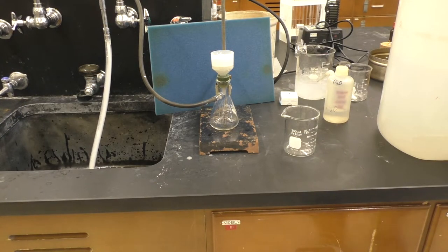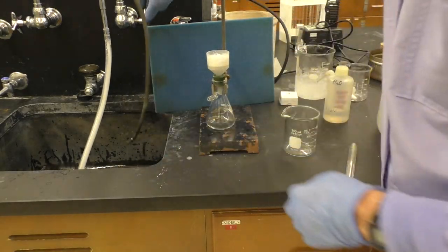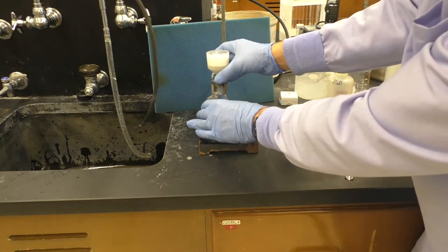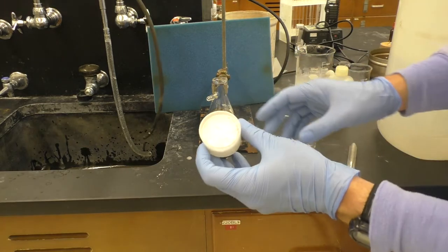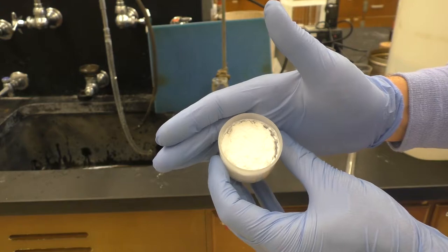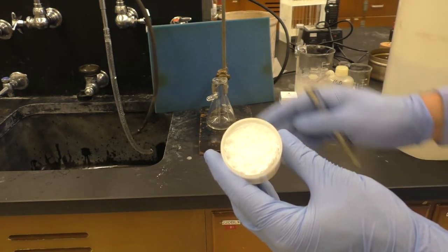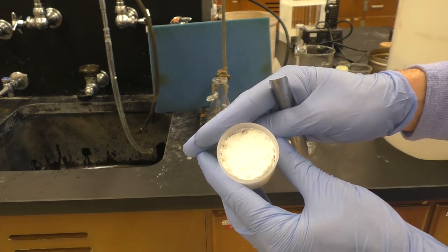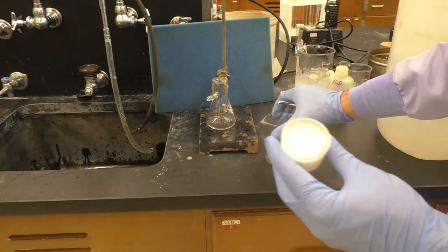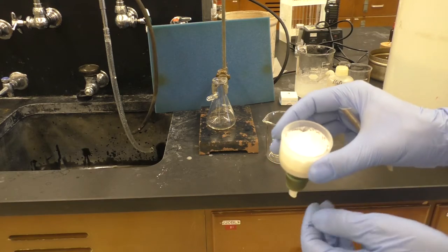So now that I've pulled air through it for a while, I can disconnect the water aspirator and turn it off. And then I can begin to collect my crude product. Here you'll see it's just in the funnel right here. There's a lot of material there. And I bet that even though we pulled air through it for a while, it's not very dry. I bet that there's still some residual water in there. So we've weighed our beaker already. We're gonna scrape it into the beaker and then place it in the oven for 10 to 15 minutes before we get a crude yield.